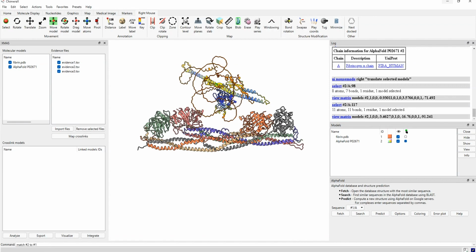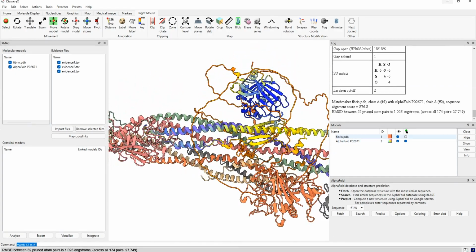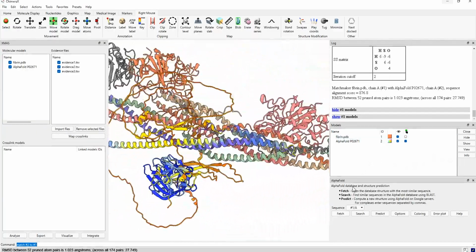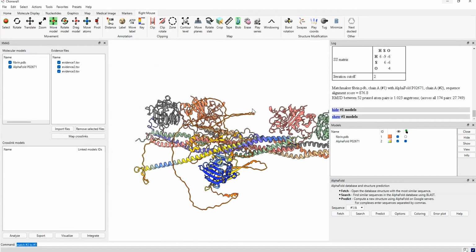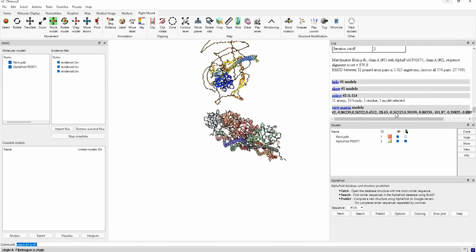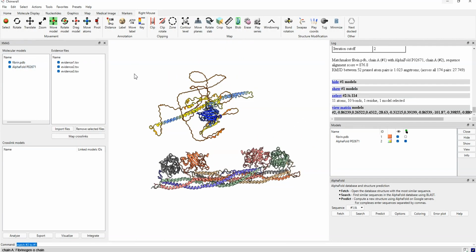When you match one model to another, you will see that it is matching for the right chain, but we still have many missing parts. So how could we complete the structures? Do we have evidence based on cross-linking MS data that links these additional models to our basic structures? So we just need to include these two models and map the evidence files.